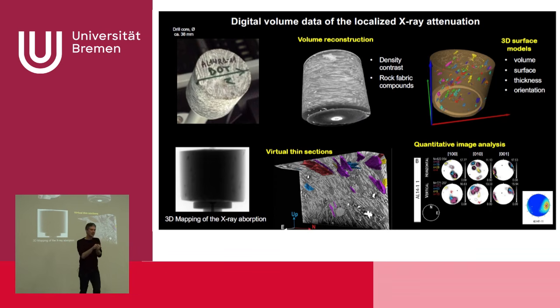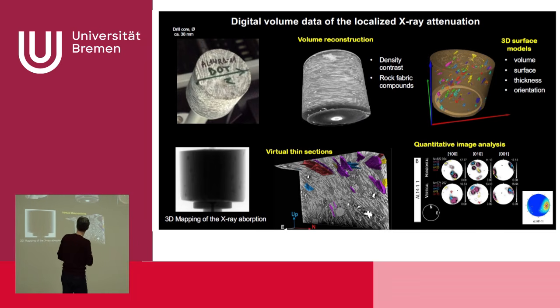If you have a process that imposes orientation on material, you could just analyze it, seeing, for example, these ore minerals that we see here also have orientation. And later you can see, if you take this core in the field or at your working bench, what kind of orientation the process you're working on imposes on these minerals here.